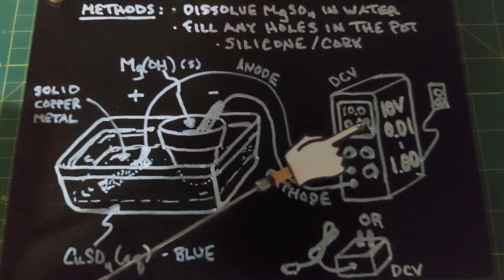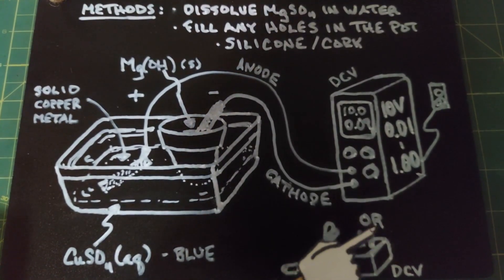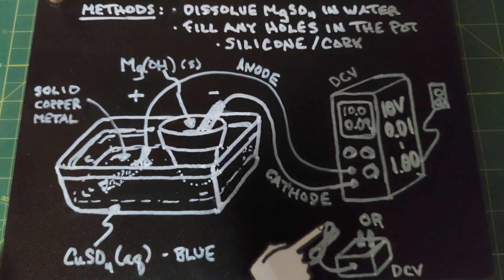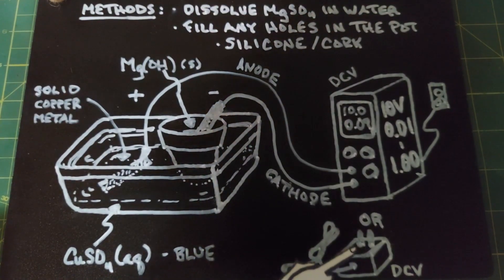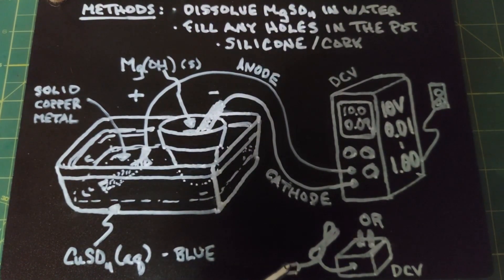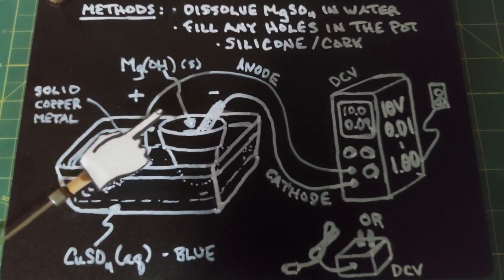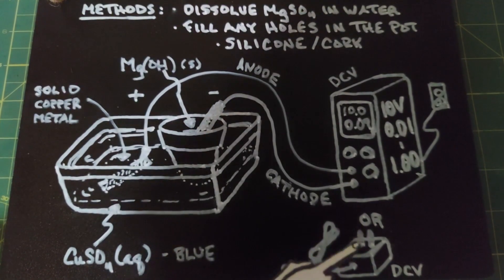If you don't have a power supply, find one of these old wall adapters and check what's written on it to see if you can get at least 10 to 12 volts out of it. The amperage will probably be low, but it will still work. You just have to cut off the end that connected to the original device and put the positive and negative to the correct terminals. Make sure it's a DC volt adapter — they do make AC ones, so be careful about that.